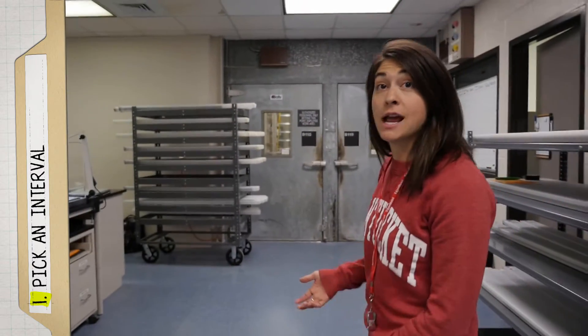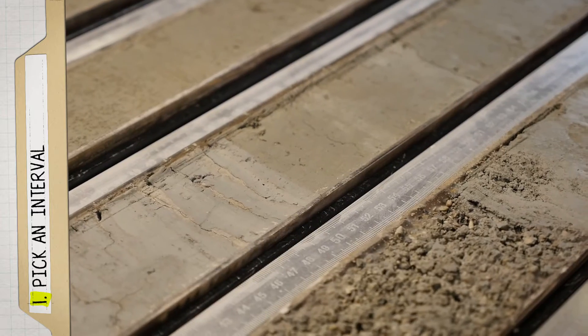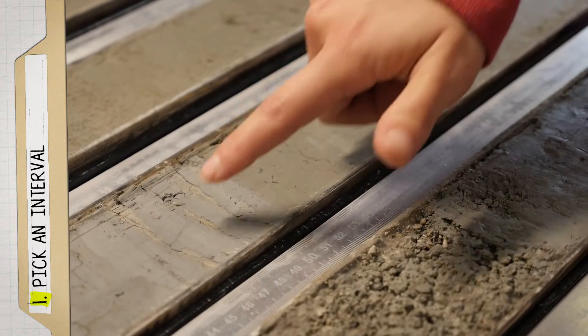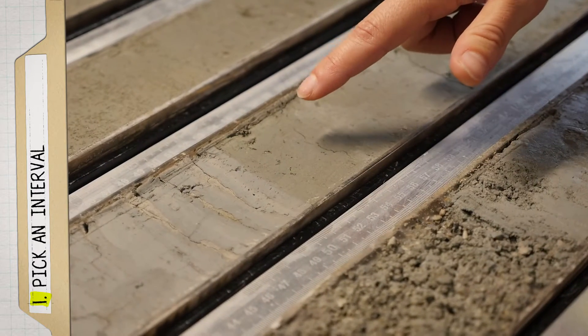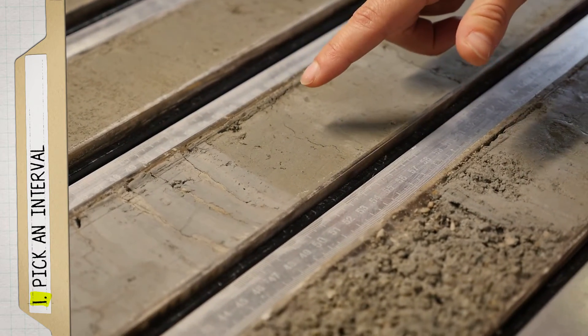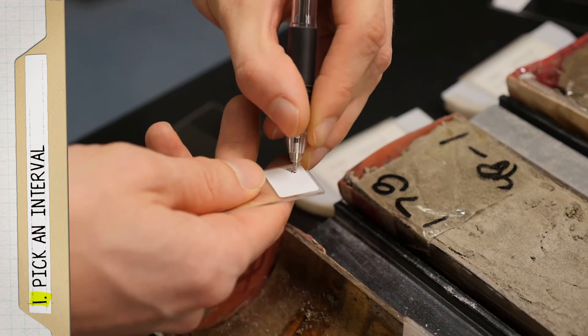So the first step to making a smear slide is deciding what exactly you want to look at. So for example, in this core, we see a color change and a texture change across a sharp boundary. So we might want to take a smear slide on either side to determine the composition.